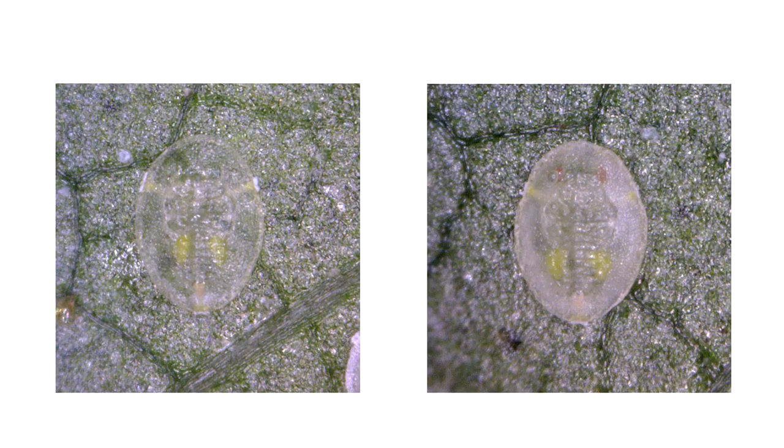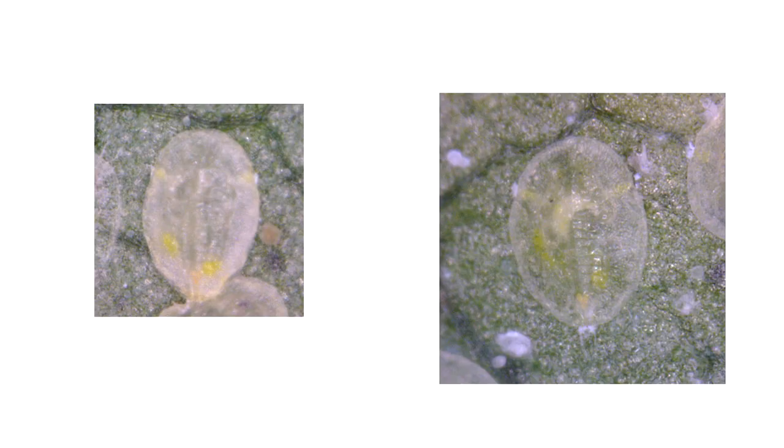We'll just zoom in now and show you what a parasitised whitefly looks like. In a healthy silverleaf whitefly nymph there are two yellow kidney-shaped structures in the middle of the body. These mycetomes are symmetrical and parallel to one another.